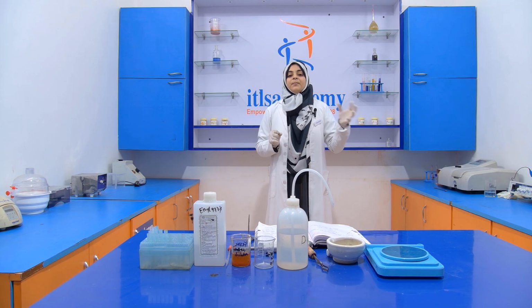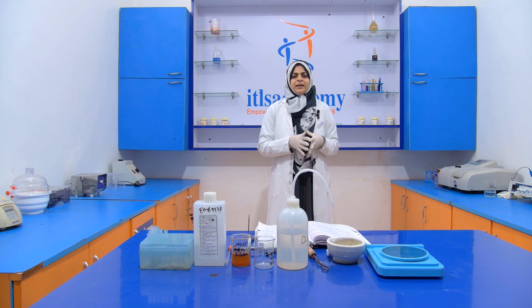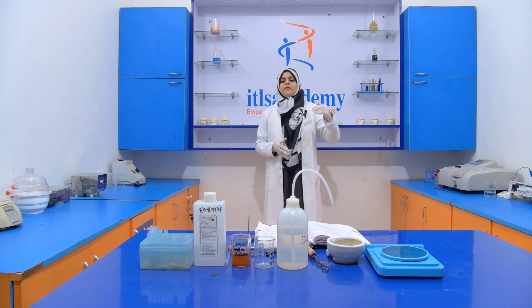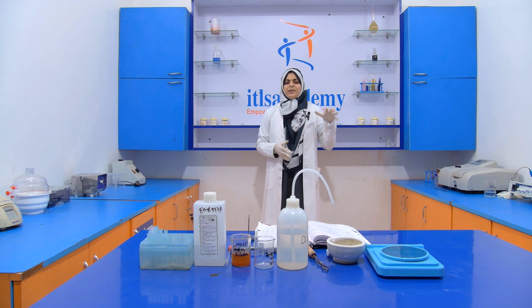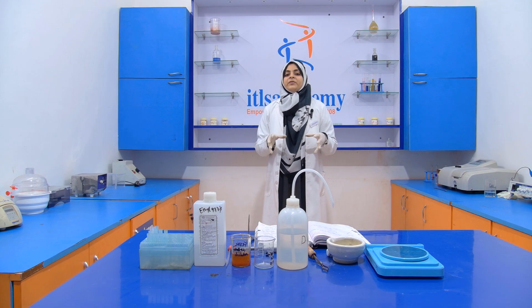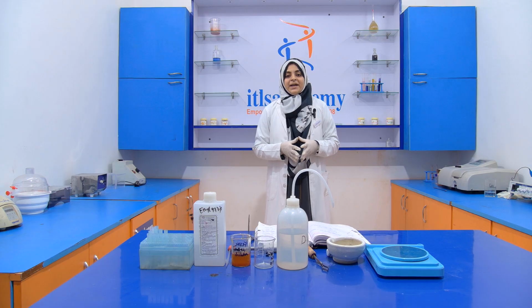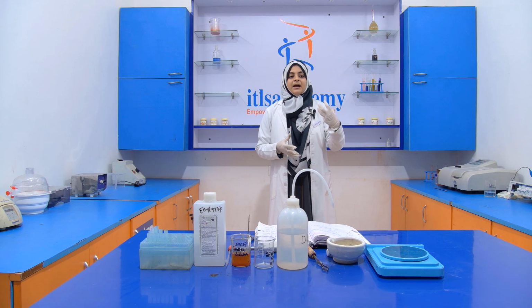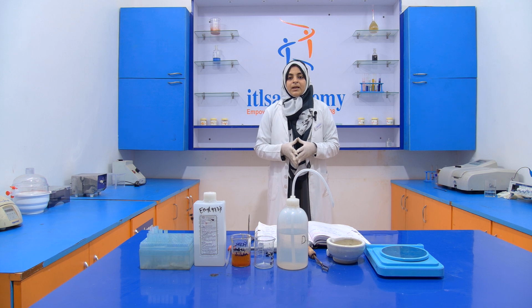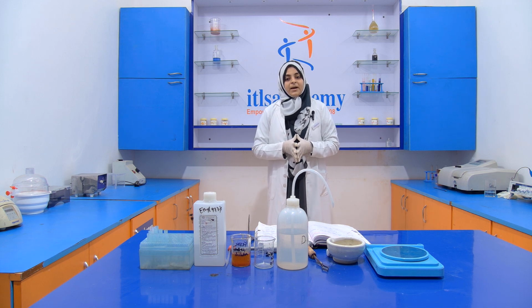This type of adulteration is done by a lower level of manufacturer or supplier. What they do is mix both the black pepper and the papaya seed, and by seeing with our naked eye we cannot differentiate it. For this we have to perform an experiment.